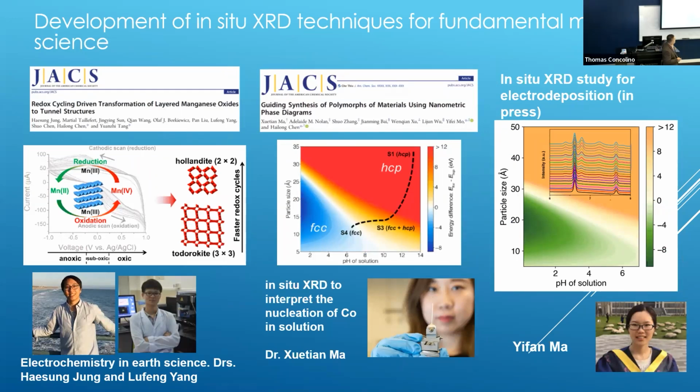in other fields, like geochemistry, in collaboration with Dr. Tang sitting there. We use XRD to check the elemental reactions. And recently we also developed XRD for electrodeposition or electroplating. It's interesting, but I don't have time to go into it.